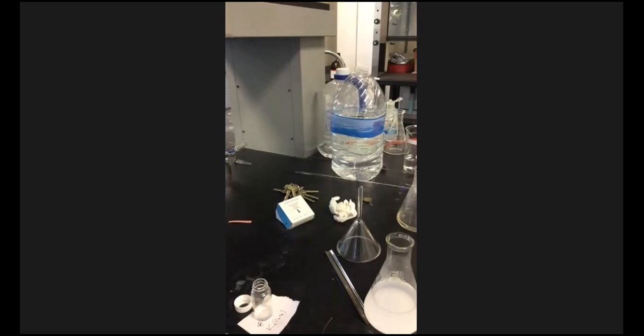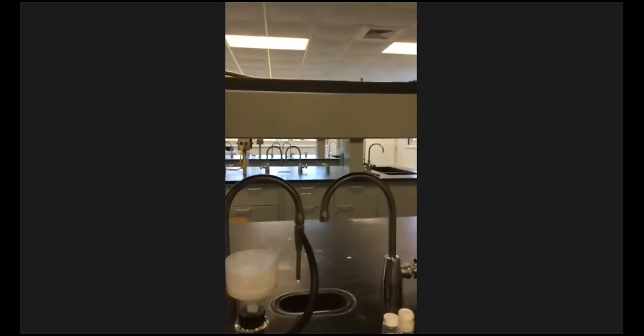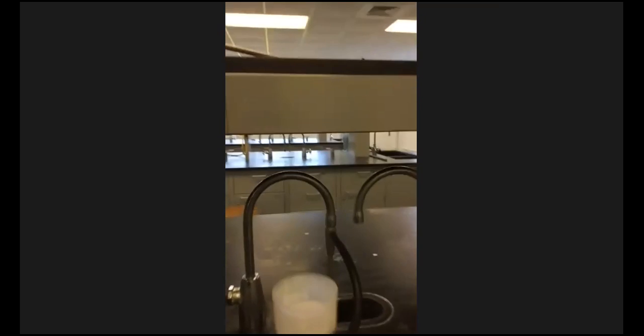Are y'all following that? Because if more precipitate comes out of the solution, what that means is that it needed a little bit more of the other reactant in order for that precipitation reaction to occur. Does that make sense? Yes. Okay. So I think I'm going to try something here right quick. So I can put it up here.